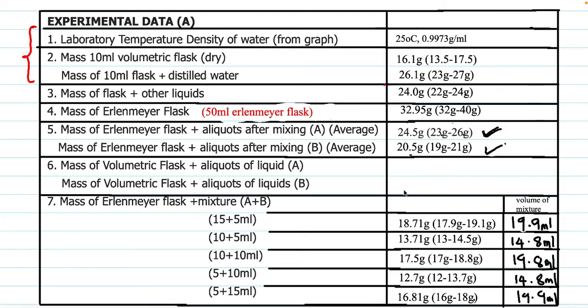If you check out the video played earlier, it is 19.5. So mistakenly I had changed it to 20.5. Please remember that if your value is within 19 to 21, you'll be very correct. I'm going to use 19.5 because I'm very sure of this value. If you carry out your practical very well in the lab, irrespective of your lab, you're supposed to get a value within 19 to 21.